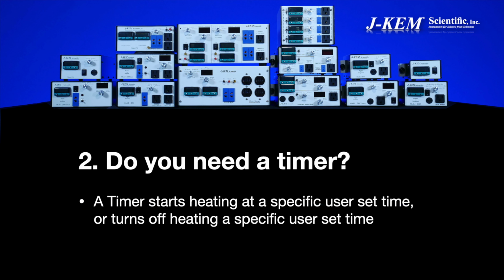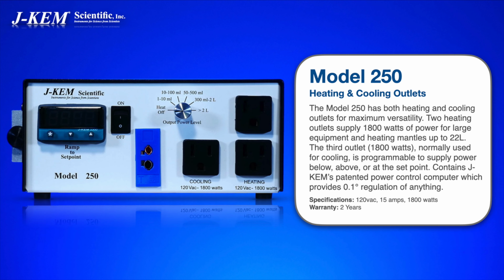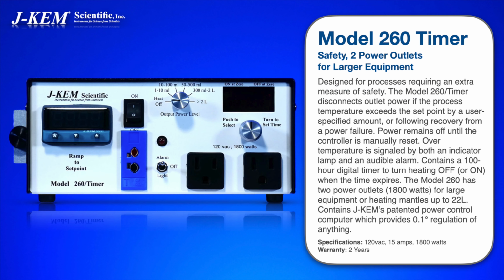Once you decide whether you need one of the smaller research controllers or one of the more powerful research controllers, the next thing to consider is, do you need a timer? For many of the temperature controller models that we offer, you can get it with or without a timer. For example, you can get just a 210, or you can get a 210 timer. You can get, in our higher power controllers, a 250 or a 260 timer, which are very similar controllers.